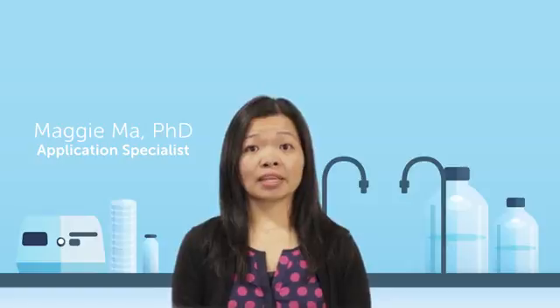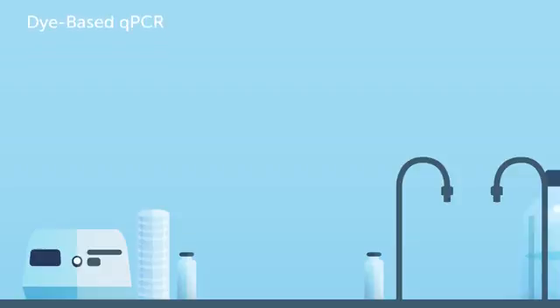qPCR is a common molecular biology technique, but choosing the right detection chemistry can be confusing. I want to clear up some of the confusion by reviewing the differences between the two most common types of detection, dye-based and probe-based qPCR. Let's start with dye-based qPCR.